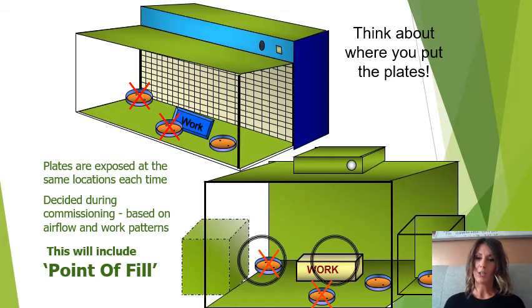And we want one in the hatch, our support hatches. In my trust, we do it sessionally just to provide us that extra assurance that our transfer technique is being effective.